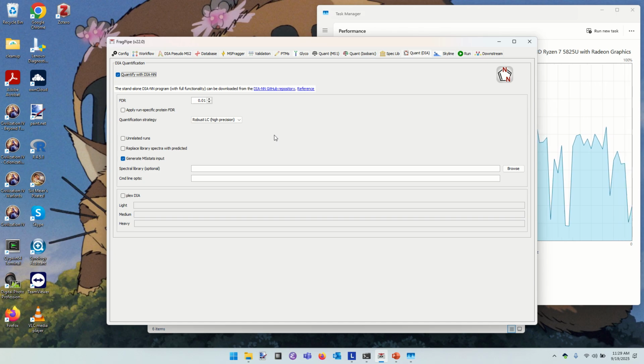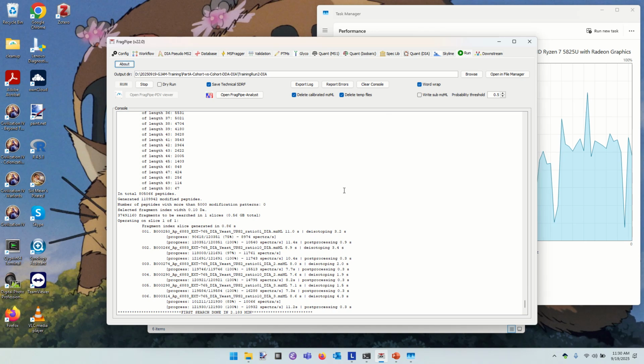So I didn't do the dry run on the run tab, but that should show exactly how it's invoked, and if it's failing to invoke something it should, that would be worth knowing. Yeah. So I would hazard a guess that it does not do MBR. Really? Yes. That would be very surprising to me. But it should tell you in the output. At some point it will do a reanalysis run in the end if MBR is active, and then you will see that.